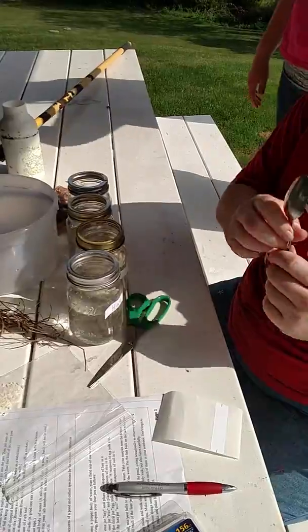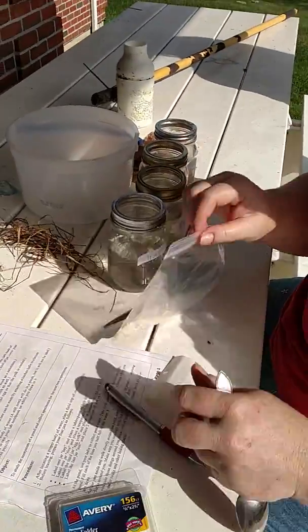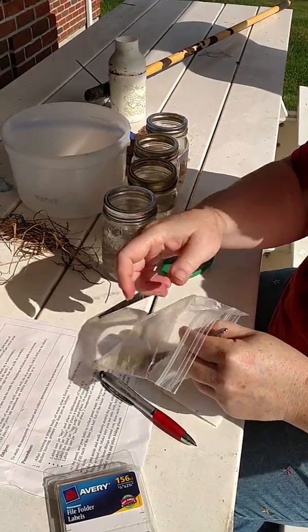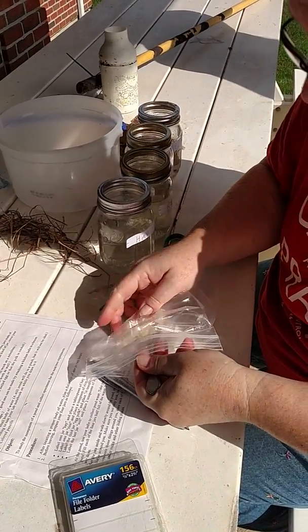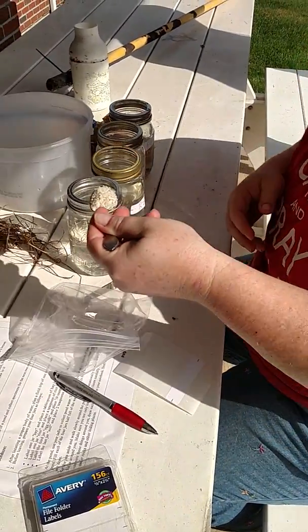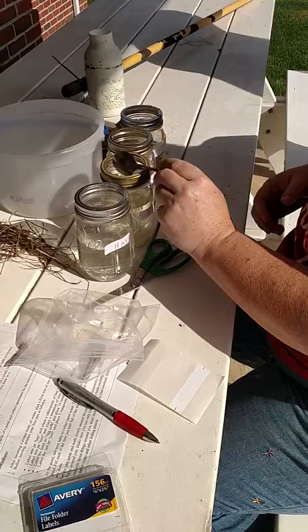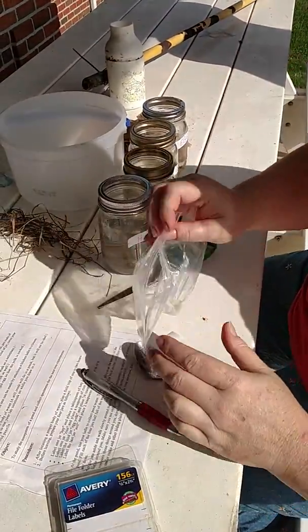We've got a teaspoon. The first thing I'm going to do — you need uncooked white rice. Brown rice, they say, won't work as well. So this is uncooked, right out of my bag of rice at home. One teaspoon of uncooked white rice, and I'm going to put it in the white rice jar. I'm going to wipe off my spoon.